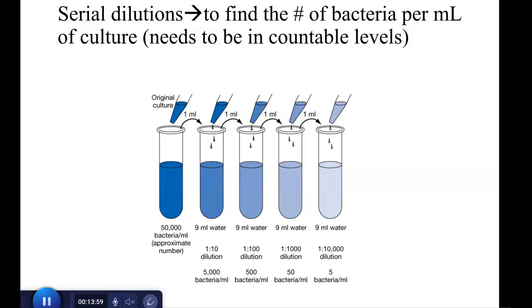It's not statistically reliable. So you can see based on this example, we're getting a range of bacteria. When we're quantifying bacteria, because we have no idea how much bacteria we have in our sample, we need to do a serial dilution in the hopes that one of those will actually hit that sweet spot of 25 to 250 CFUs.